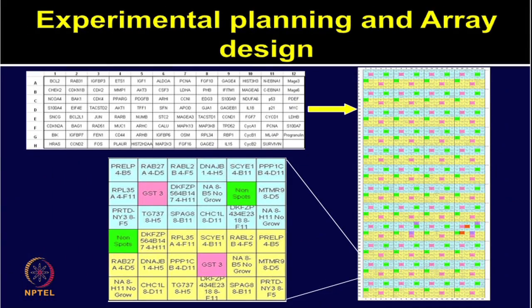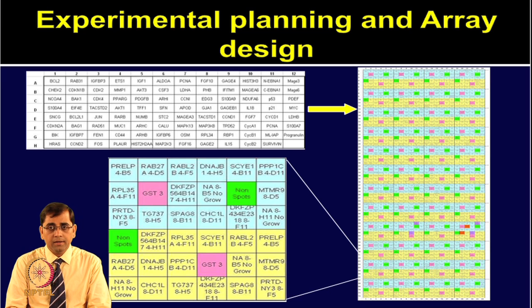For example, I have shown you a few insets here. The very top panel in these slides shows different genes which you would like to make on the 96 well plate while doing DNA prepping. First of all, you have clones and now you want to do the DNA prepping. You know in each well, for example, in A1 what gene it would contain.